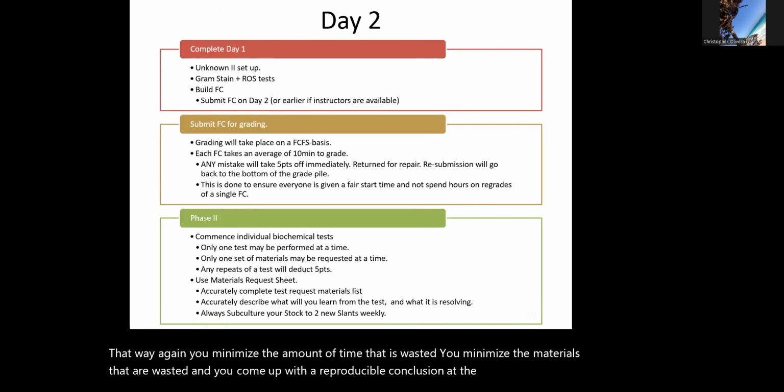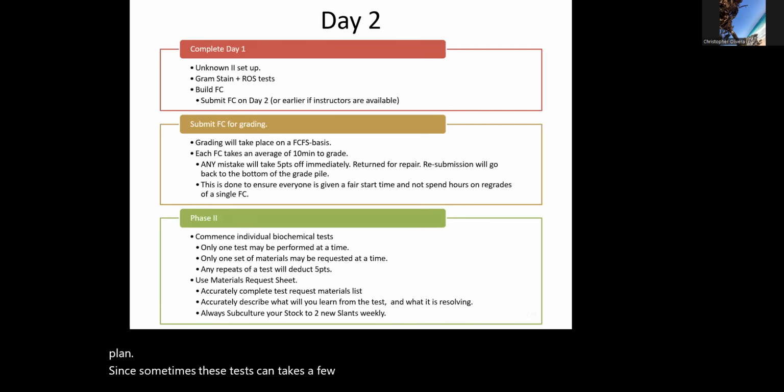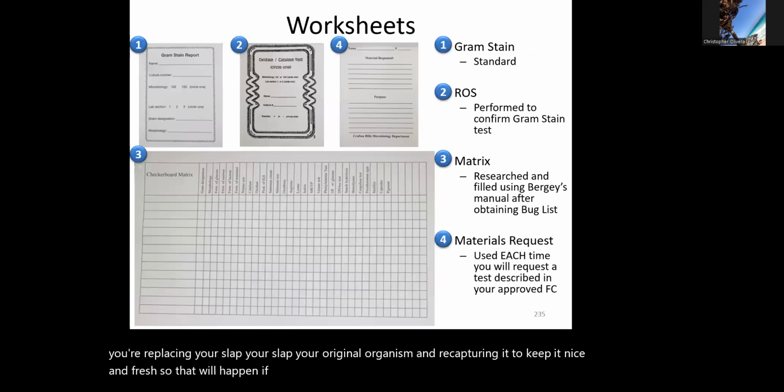Okay, so that's the plan. Now, since sometimes these tests can take a few weeks, we always encourage you to make sure you're replacing your original organism, and reculturing it to keep it nice and fresh. So that will happen if you're working with a live organism.